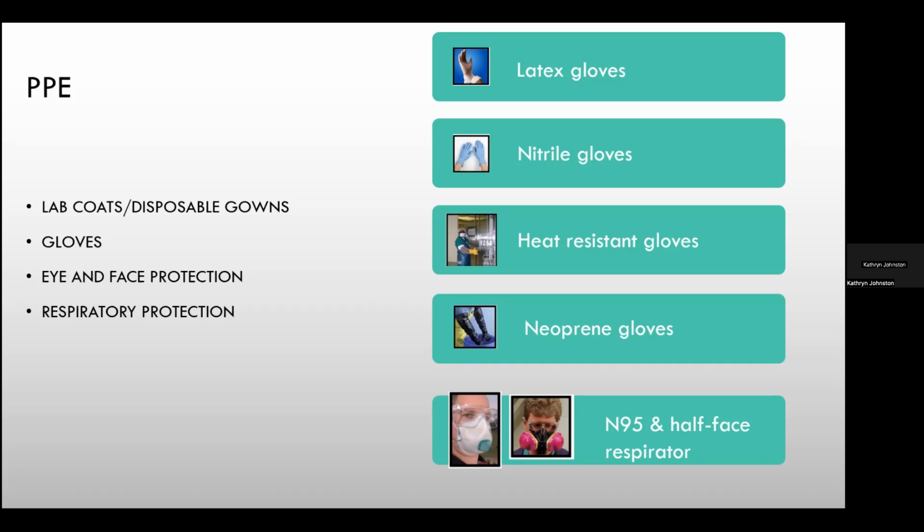Safety glasses are also primary protectors, and we usually see them, but the problem with the goggles and the safety glasses is sometimes they get fogged up, and so people have a tendency to fiddle with them a lot, which is a problem. So you really should have glasses that fit properly. Safety glasses are sturdier, so they're better.